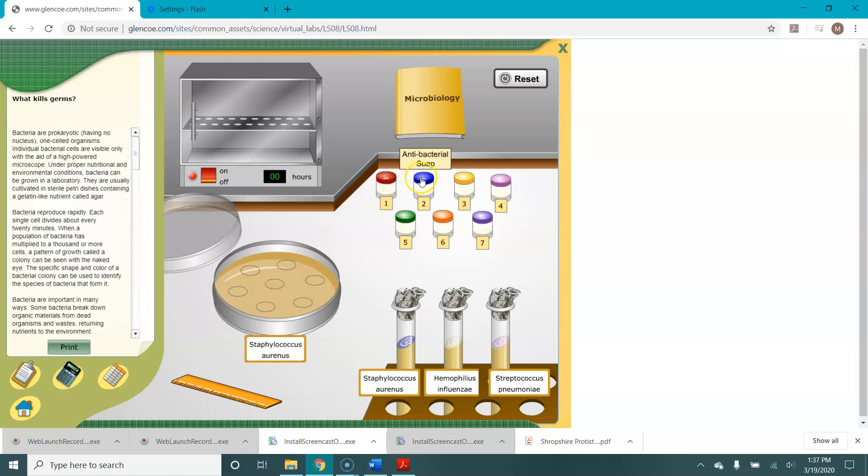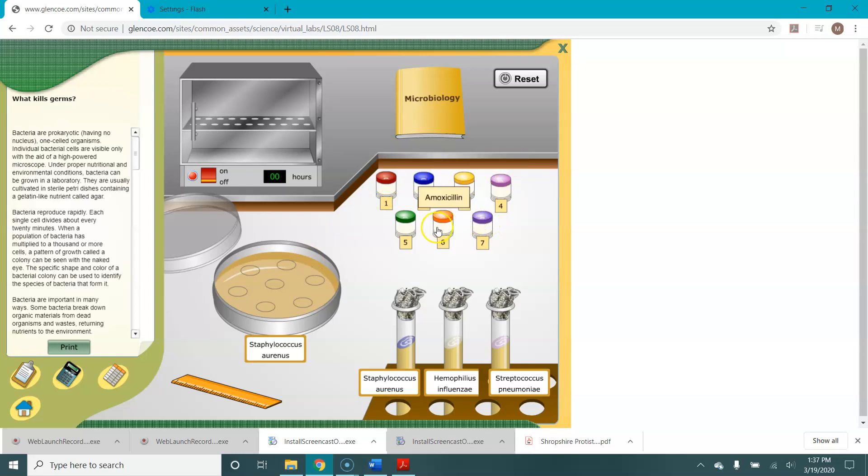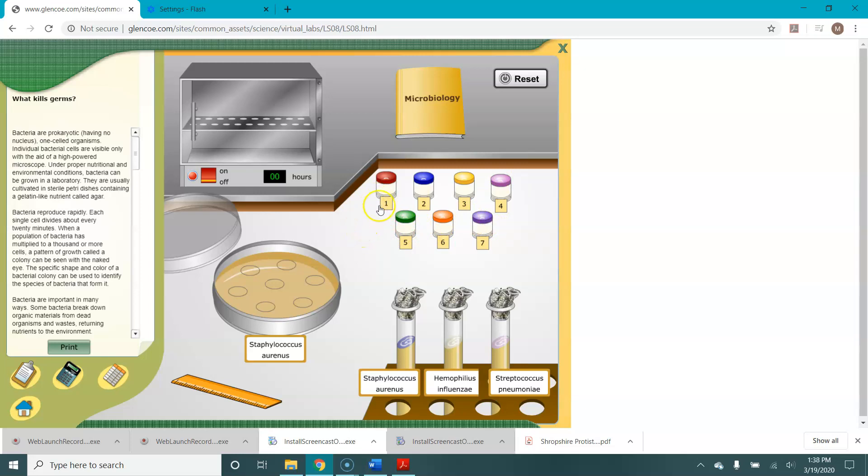We now have paper discs soaked in different kinds of antimicrobial agents including one that is a control, our sterile filter paper discs. So we need to drag and drop these onto the plate.